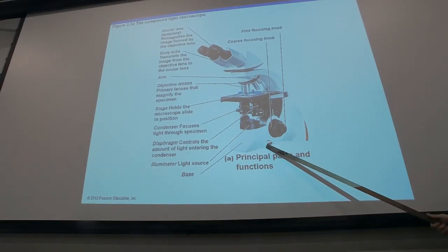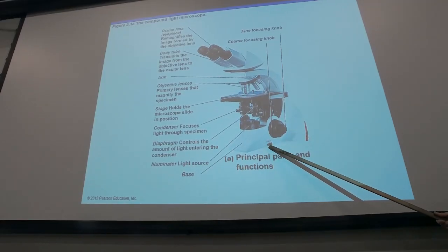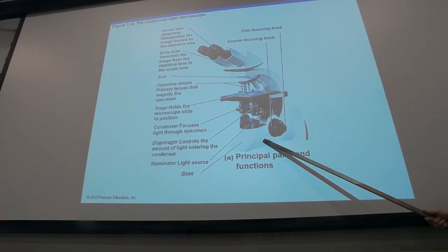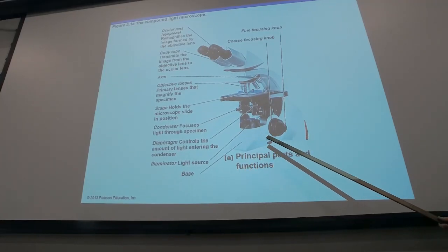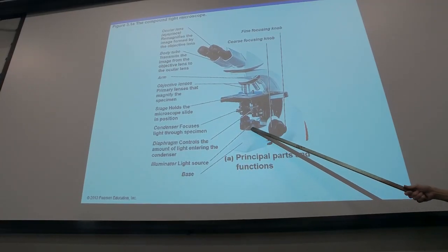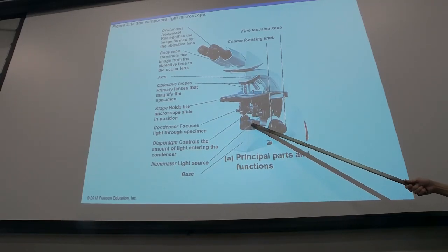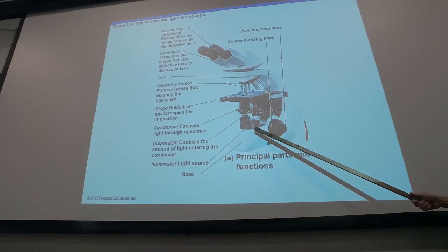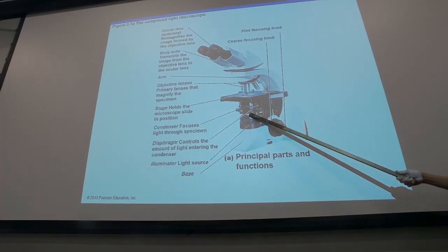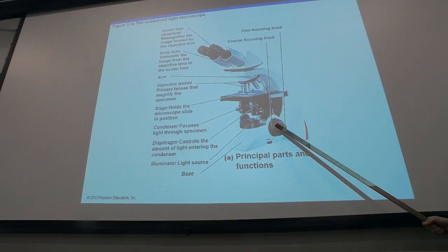And then at the base of the microscope, which is this, you have a light switch, and then you have this sliding knob that basically controls the amount of light that goes through the lamp or illuminator, in which you have a light bulb, or you may have an LED, that allows light to go through the object, and then you will be able to see.